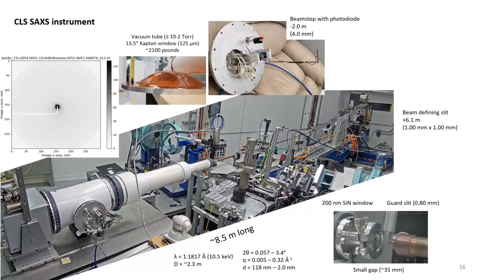We are making some composite material that is actually a nuclear-based form. So we are interested to figure out the thickness of the layer, which is the surface layer on top of our material. But we couldn't calculate that yet because it's very difficult. It's very thin, probably, and then it's also amorphous.